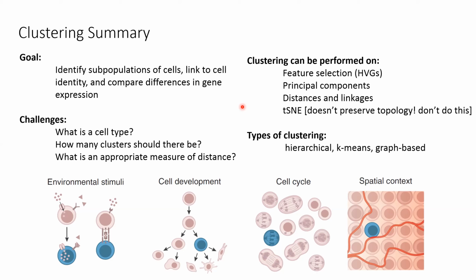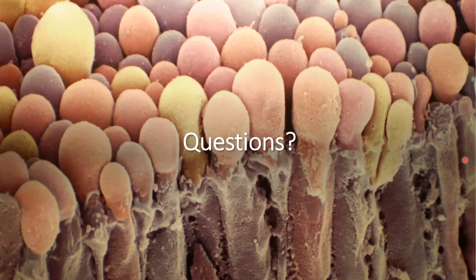So if any of you are about to create some single cell RNA-Seq data, I think it would be super helpful to the field if you could try to do your best to orthogonally annotate cells before sequencing them. There seems to be lacking a lot of studies that link cell physiology to gene expression, in part because it's challenging to do. So before we go on to downstream analysis, I'll pause here for questions.